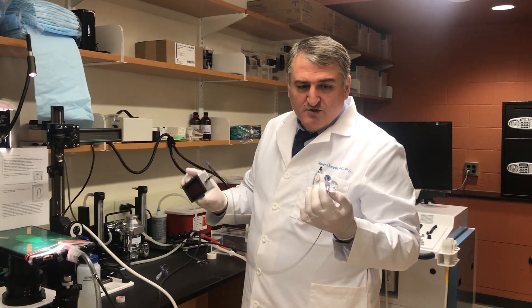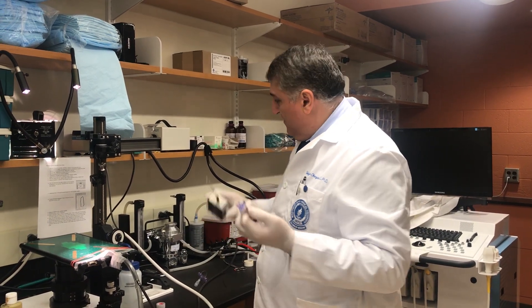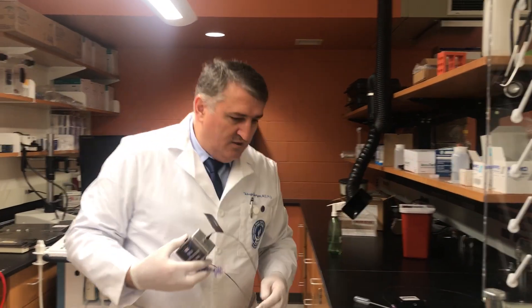Right now it's charged. Usually we charge it for five to ten hours — we keep it on charge overnight. If the battery goes down, I can connect it to a power source right here.